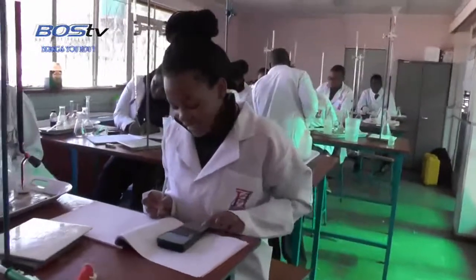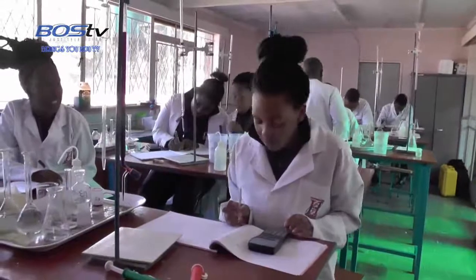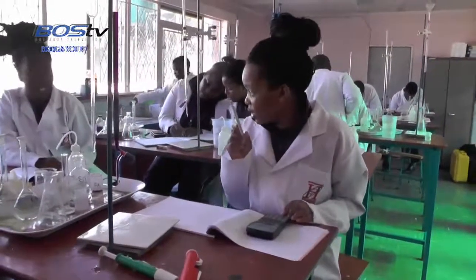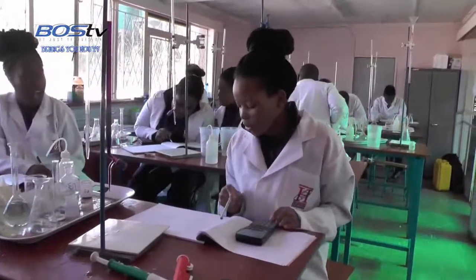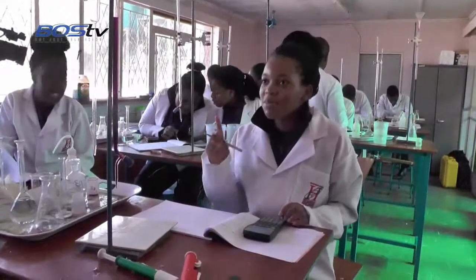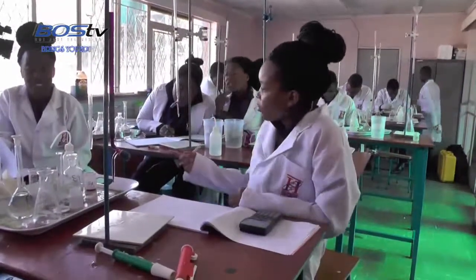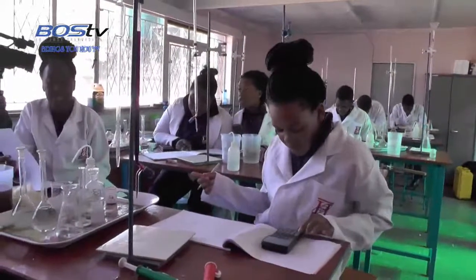It's weight. Okay, its molecular MR is supposed to be... our mass is 9.7. The average, yes. I think that's where the problem is. Over the more you got in the previous part. So then our mass is what? It's not 9.7, that's the problem. Can't we say it individually? 134.2. Yes, which was the mass of the beaker and the FA1.